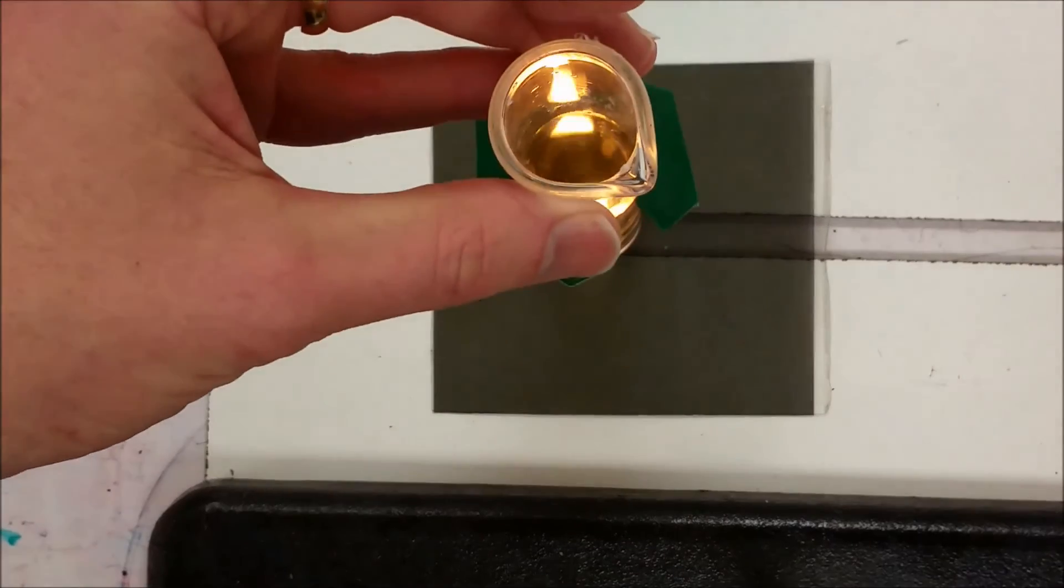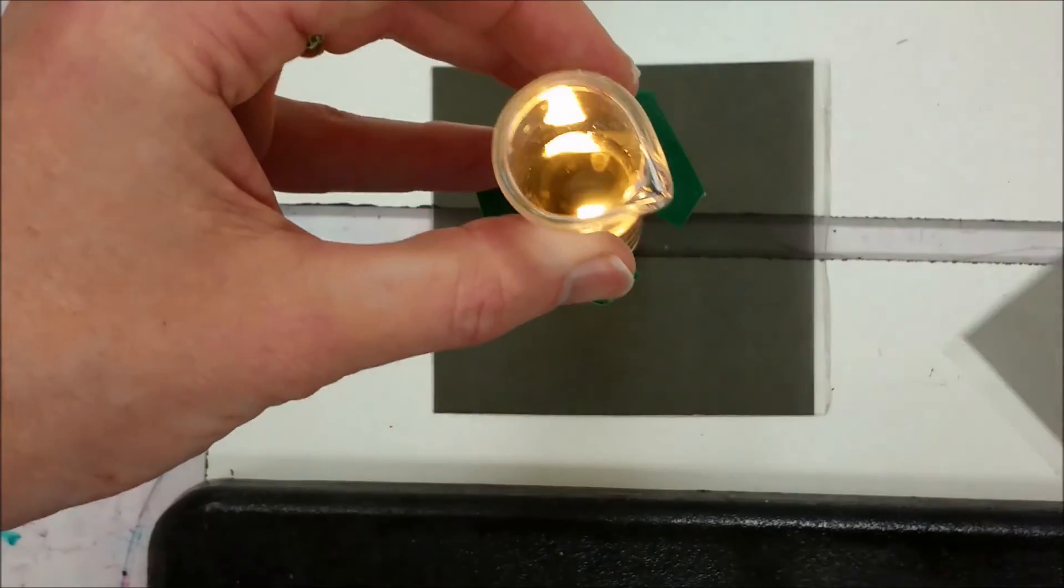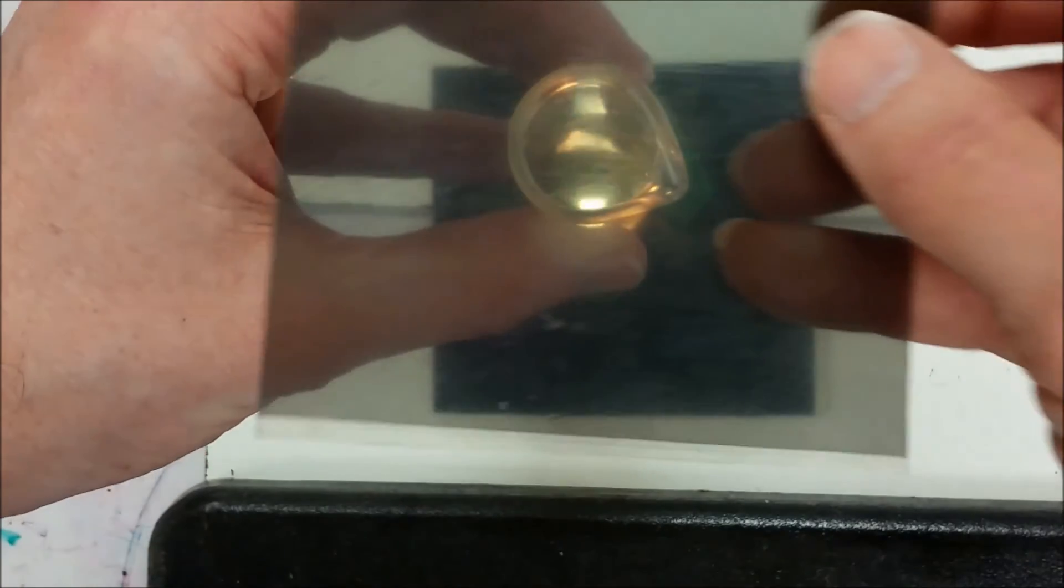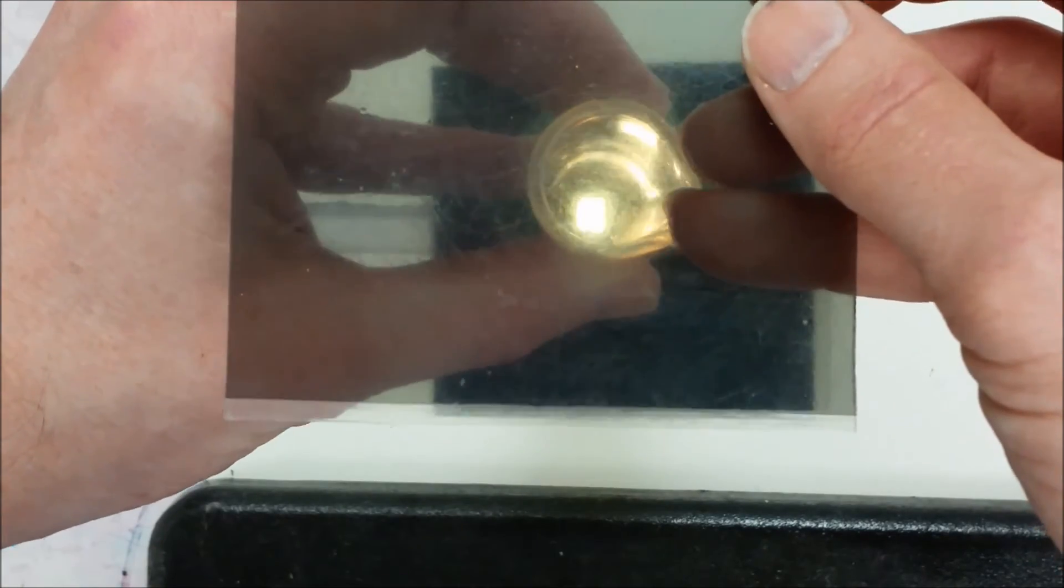That's not coming through very well, it's not rotating enough for me to detect. Let me try a solution that's a little more concentrated.